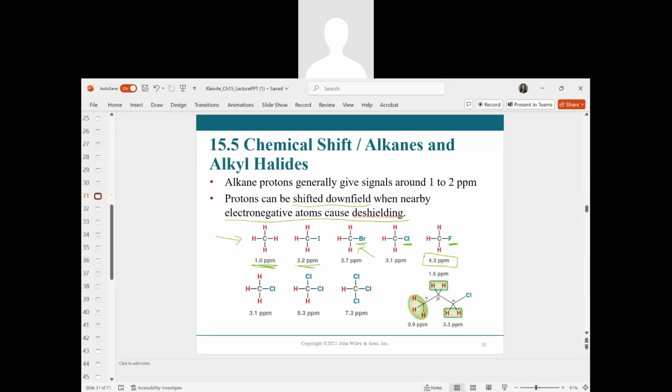And we can also see this extends. So the first carbon atom connected to the chlorine here has 2 protons, and their signal, again, would be the highest, that 3.3 delta. And we can see that these 3 protons, again, of that CH3 over here, would all produce about 0.9 ppm. So that is the 3rd carbon down, our gamma carbon. So our beta carbon, those 2 protons would be somewhere in between.